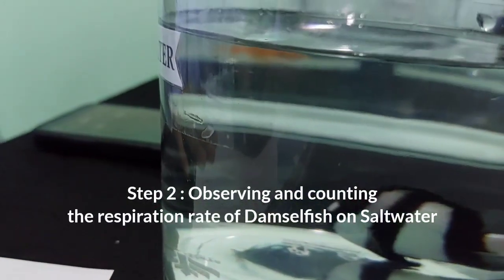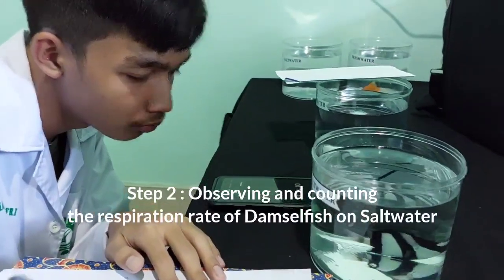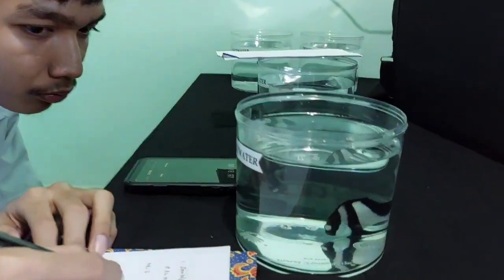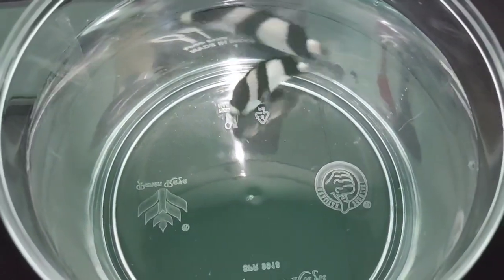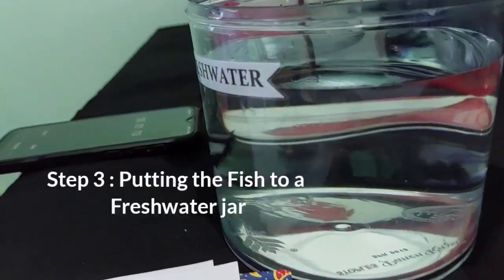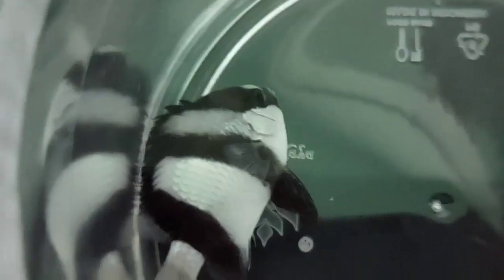Step 2. Observing and counting the respiration rate of the damselfish in salt water. The operculum movement is counted every 1 minute for 3 minutes. Step 3. Fitting the fish to a freshwater jar. The fish is taken with a tea strainer and then the respiration rate is counted again for 3 minutes.